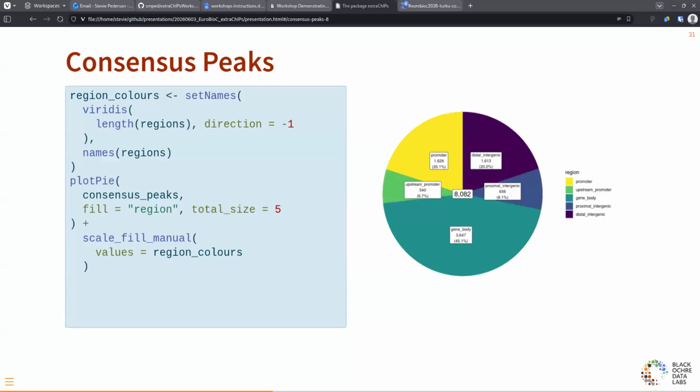And those labels are incredibly manipulatable. Using glue syntax, you can absolutely mess with those labels as much as you want. We'll do that when I do the donut plots. I like pies and donuts, so I've got a donut plot coming as well.